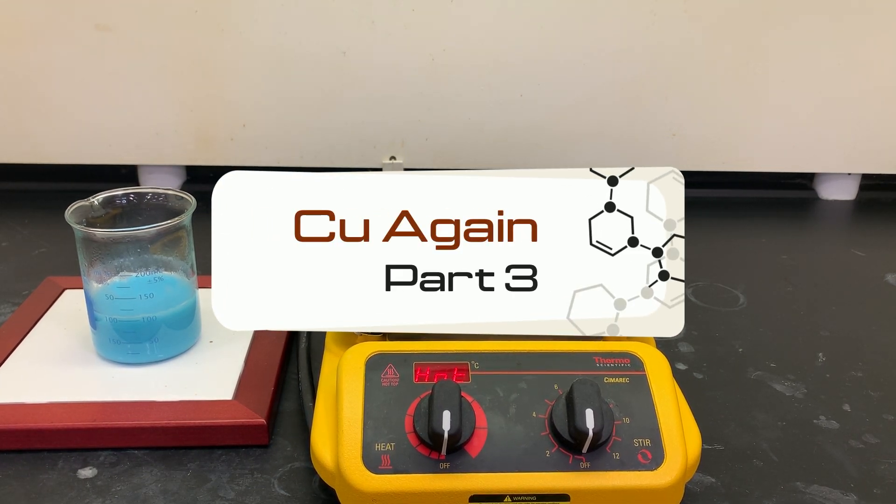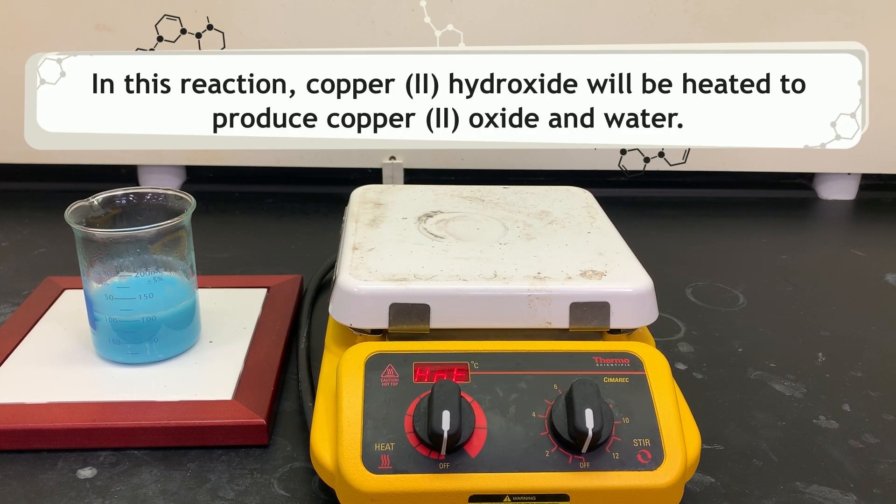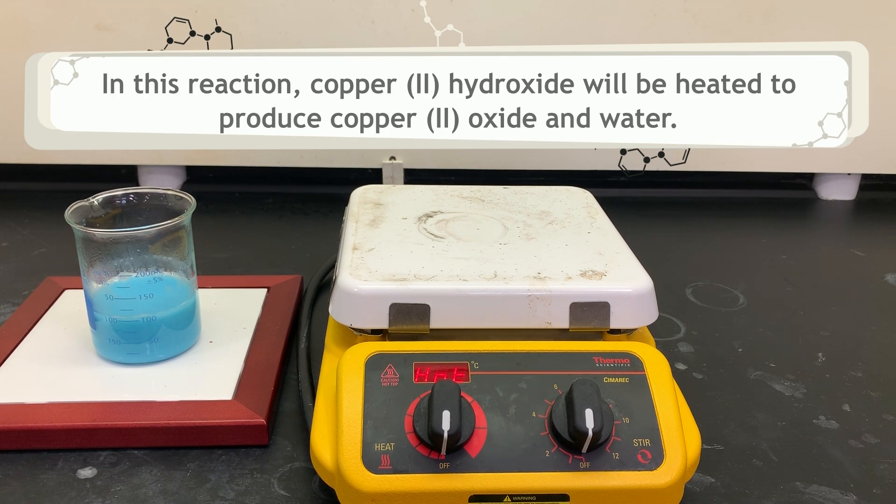Okay, on to part three of our five reaction sequence. In this reaction we are going to be taking that copper 2 hydroxide and heating it to produce copper 2 oxide and water.